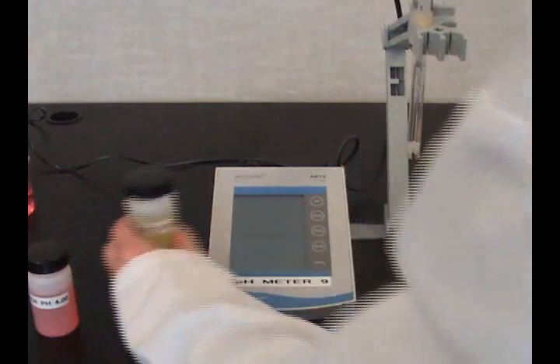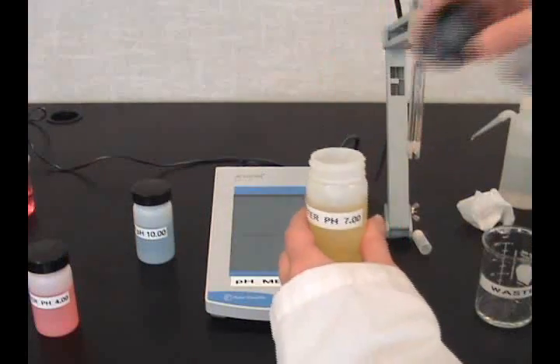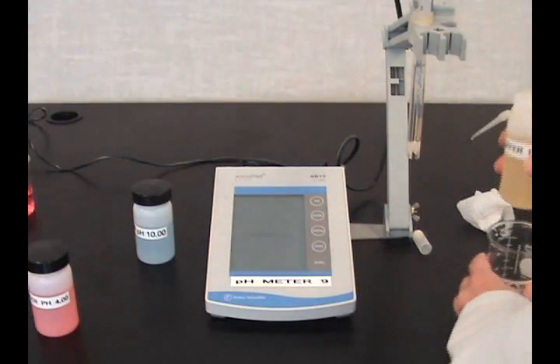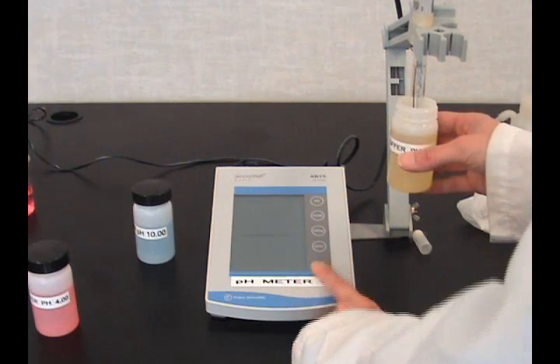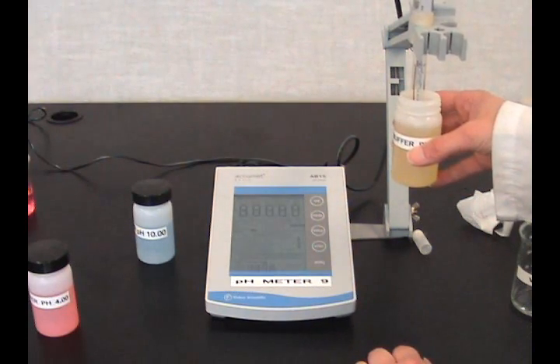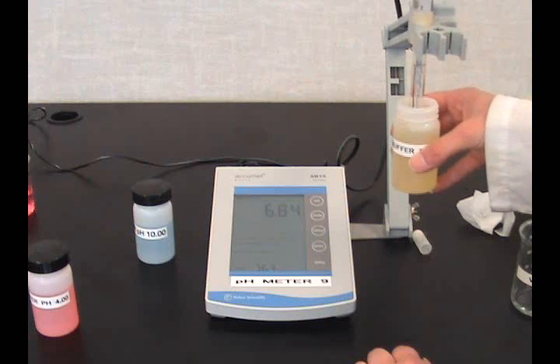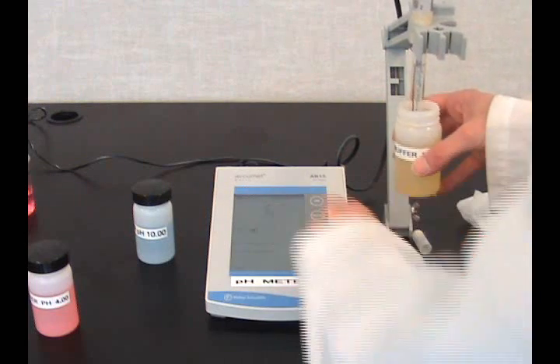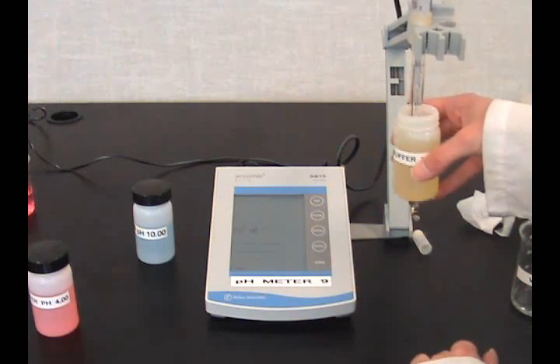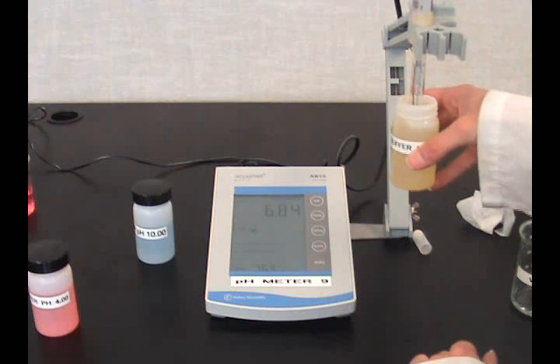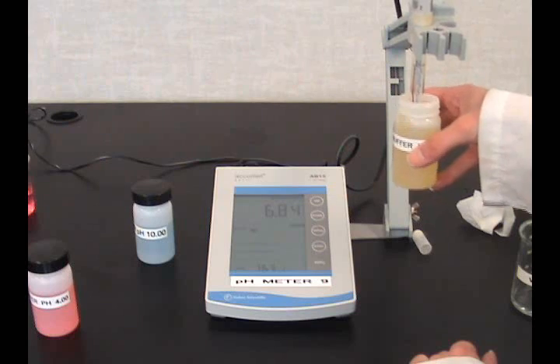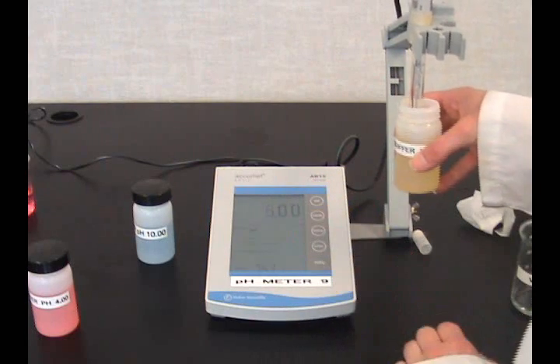Select a buffer. Ideally, 7 is used first. Immerse the probe in the buffer while swirling or stirring it constantly. Press the standby button. The buffer group will display in the standardization mode. When it stabilizes, press the standardized button. This sets the buffered standard.